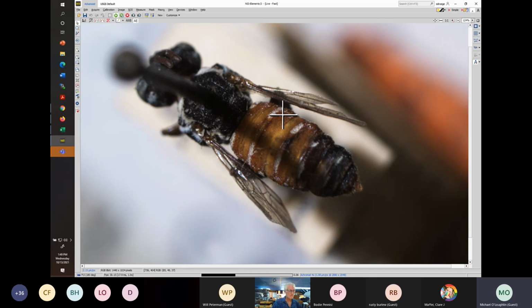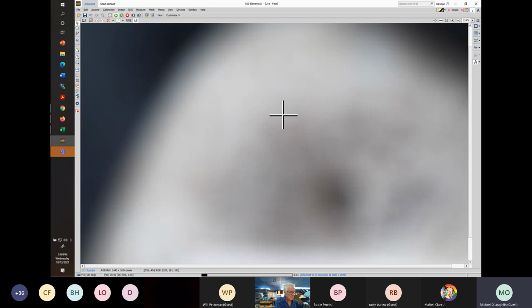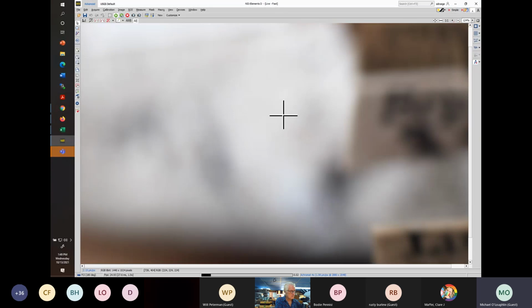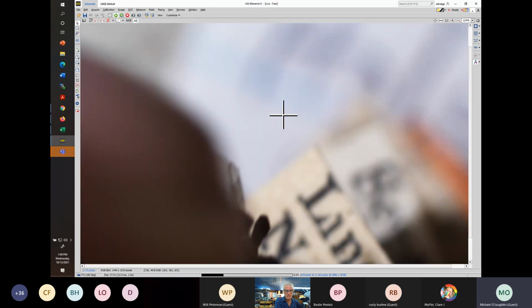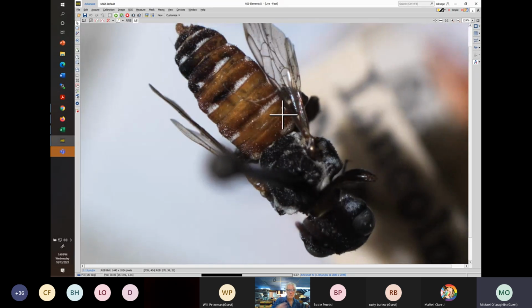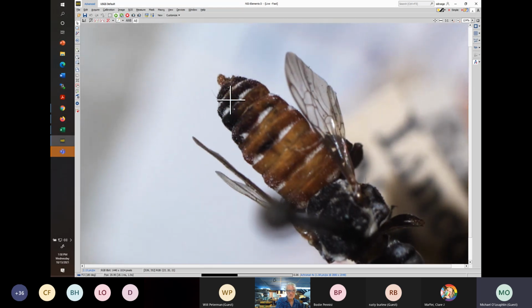But what is in this one, my specimens had been given away. This is Holcopasites stevensi. I don't know where that's from. Oh wait, I can tell. They all look pretty similar. It says Nebraska, so that may be an old name. It's in Discover Life. Okay. All right, so this look with the red abdomen with very bright white, but usually dot-like, sometimes striped, views is indicative of the species.